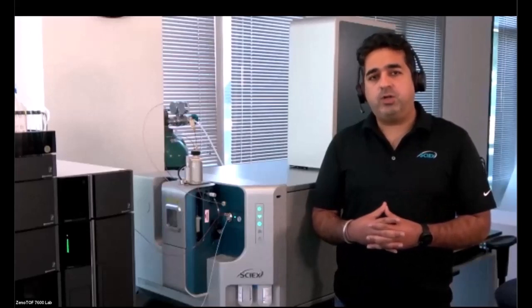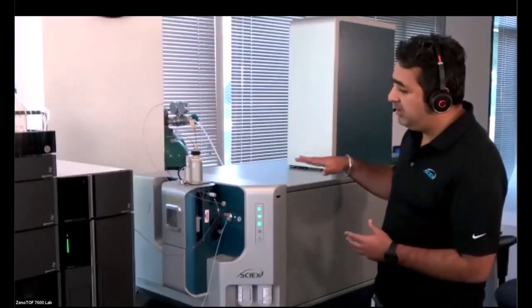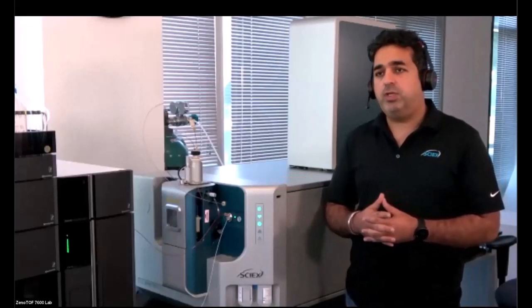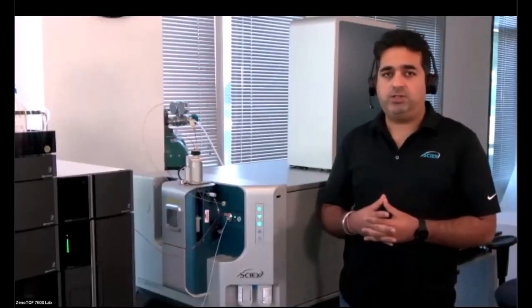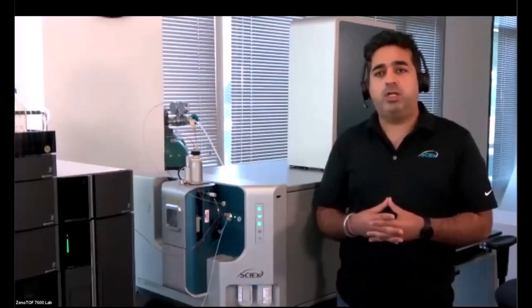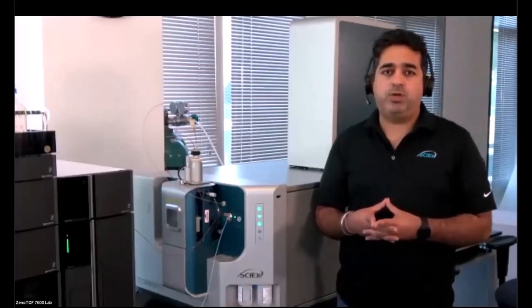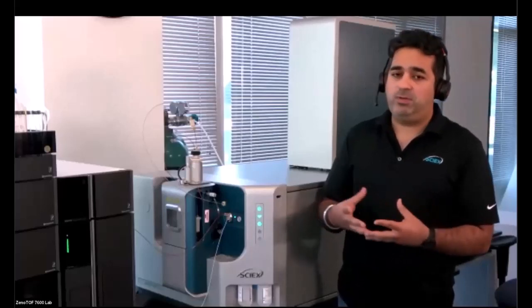The instrument we are going to use today for our masterclass is the SCIEX ZenoTOF 7600 system. It's a benchtop QTOF with the new alternate fragmentation technique, which is called electron-activated dissociation, which is really important when you are dealing with metabolite identification or trying to identify the site of biotransformations that we're going to discuss in the upcoming 60 minutes probably.